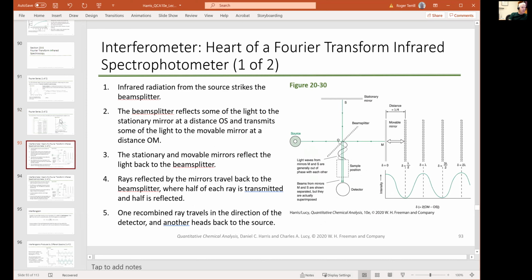So here's how that happens. This is how the interferometer works. This is how the modulator works. What it's going to do is take the light in, modulate it, and then you'll have a sample in and a sample out to get a blank and a sample, right?